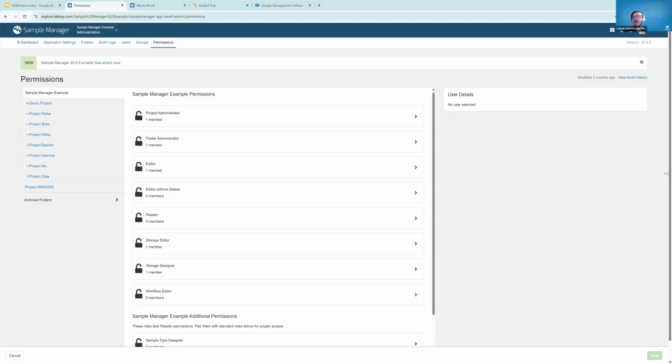And then we have a question, how long does it take to set up the lab manager for samples and workflows you have shown today? So that is a great question. It depends on what current state your data is in and how complex your workflows are. If your data is clean, if you know exactly what you need, I've gotten users set up within a week. So it's very, very fast to do.